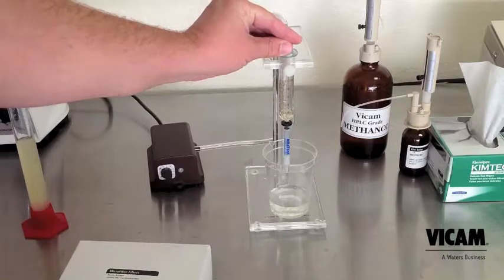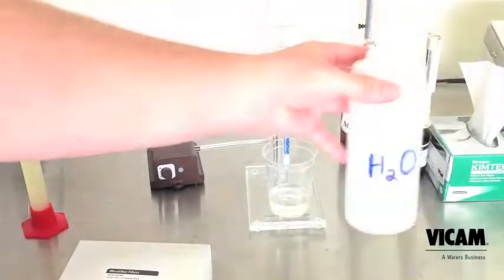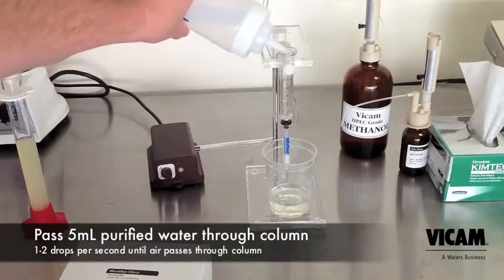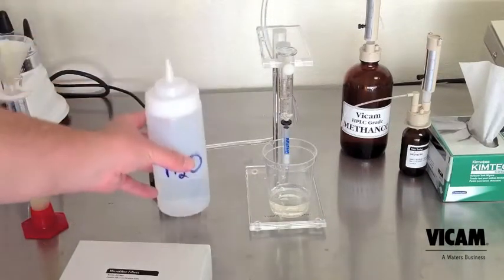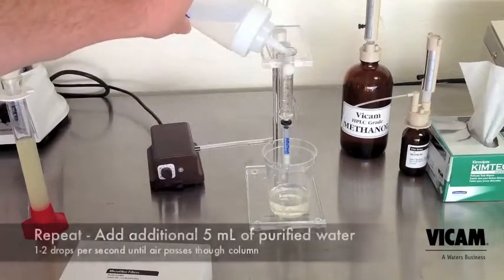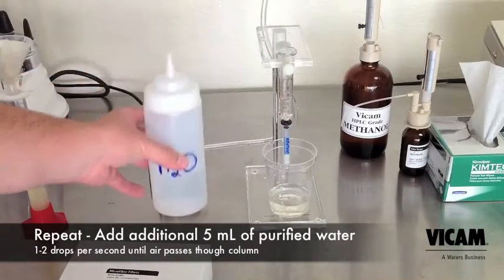This will take a little practice. When the sample is done dripping, allow air to flow through the column. Measure 5 milliliters of purified water to wash the column. Pass one to two drops per second through the column. Once air has passed through the column, repeat the last step. Add 5 more milliliters of water and repeat.